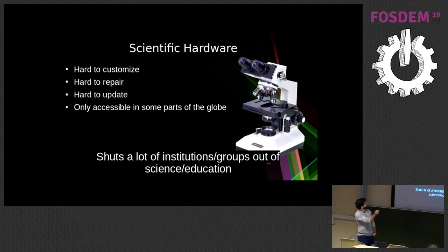So they're hard to customize. If you have a 5,000 euro piece of equipment, you don't want any student in the lab opening it up and adding LEDs and changing things or anything like that. They're hard to repair because there is only one company that provides this one specific model, for instance. Hard to get them updated. And as I said, only accessible in some parts of the globe, right? So a lot of people get shut out of this.